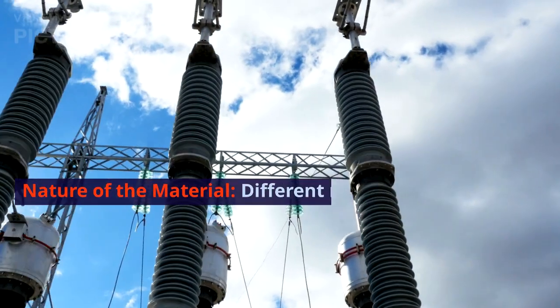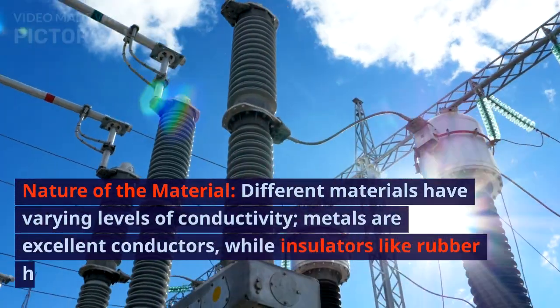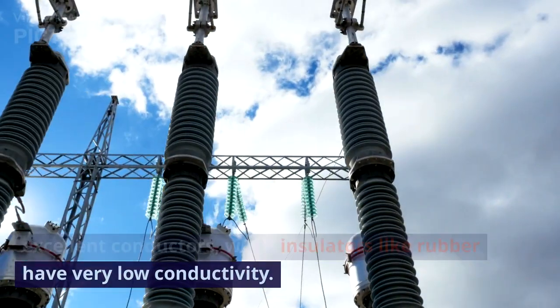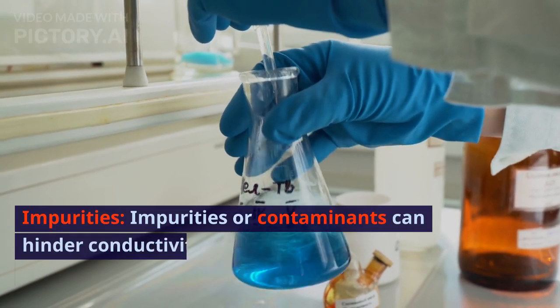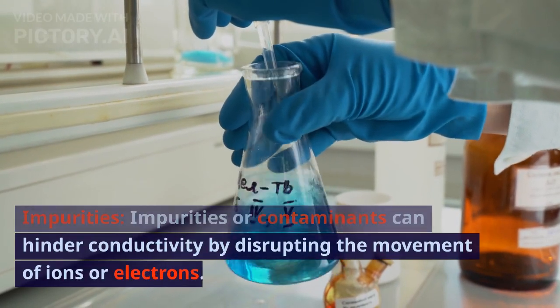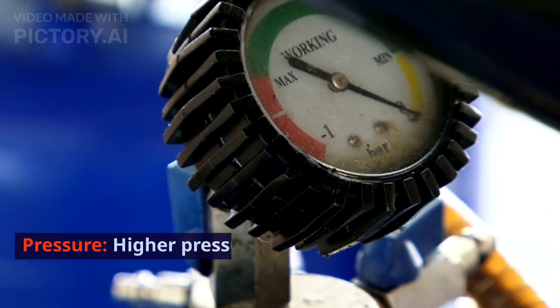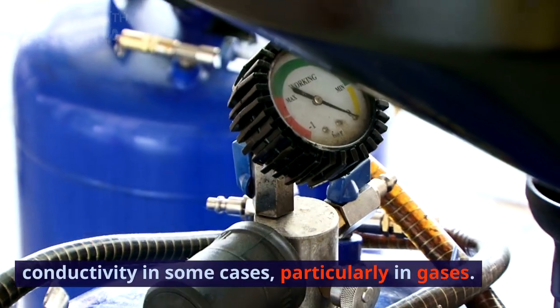Nature of the material. Different materials have varying levels of conductivity. Metals are excellent conductors, while insulators like rubber have very low conductivity. Impurities. Impurities or contaminants can hinder conductivity by disrupting the movement of ions or electrons. Pressure. Higher pressure can increase conductivity in some cases, particularly in gases.